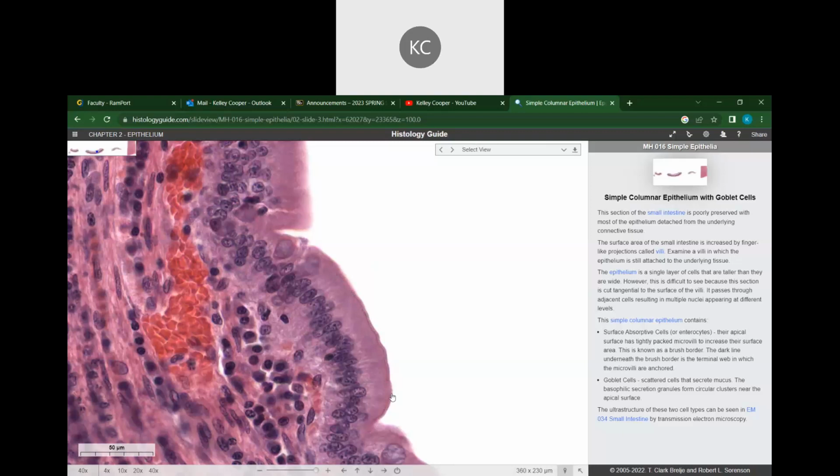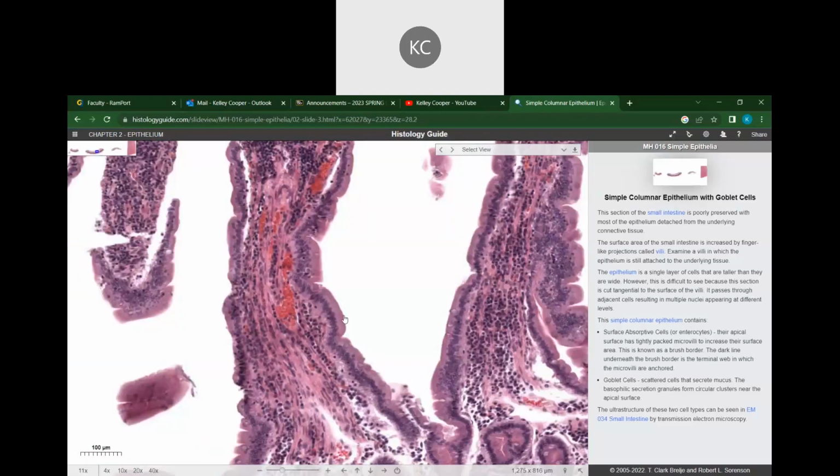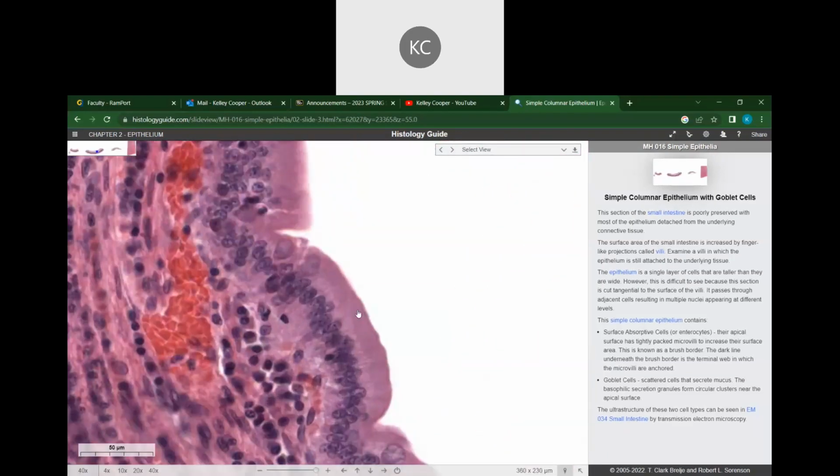Microvilli are these small little extensions of the cell's plasma membrane on its apical surface. Recall the apical surface is that which is open to the lumen. So in this case, the white region here is the lumen, and these microvilli are in contact with the lumen. We said in the first part that these apical extensions called microvilli serve to increase the surface area for this particular epithelial tissue to absorb more and more things.